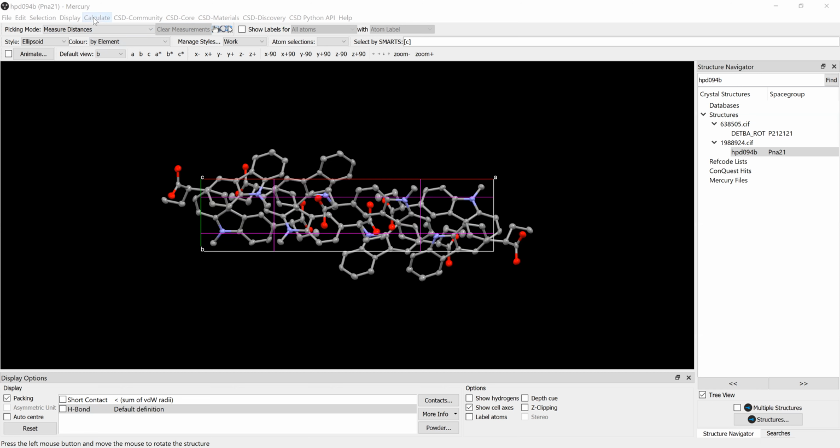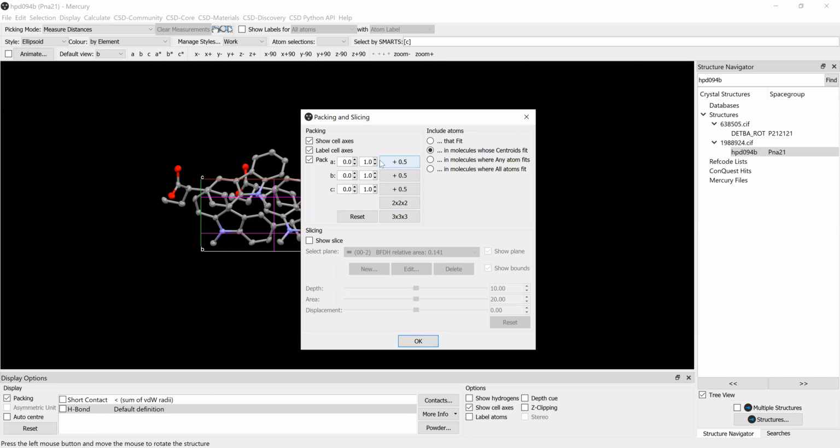And one last thing, let's just do a little packing here, see what we see.